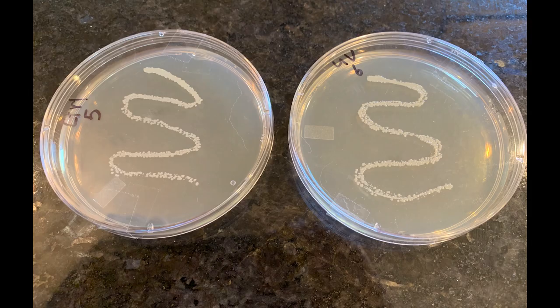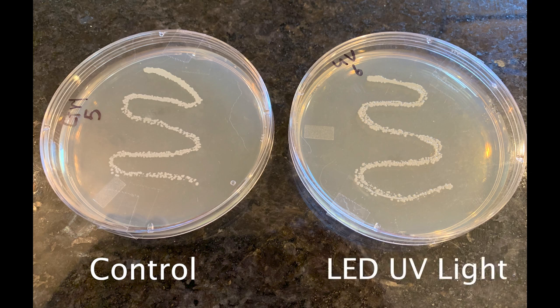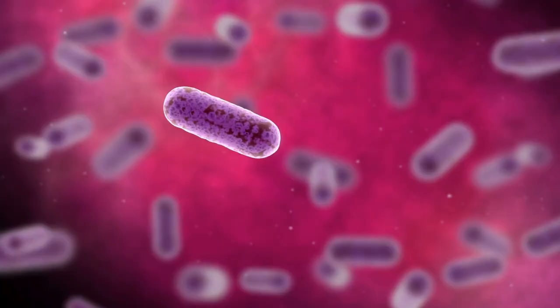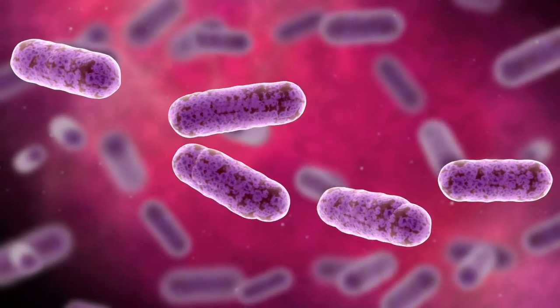This is what happened: absolutely no difference. The plate on the left is the control, and the plate on the right was the bacteria I exposed to the LED light — they both grew bacteria. I actually repeated this experiment a few times, exposing it for different lengths of time, and I got the same results every time. So that means this is a complete waste of money. It cost me $79, and that was $79 down the drain. I will never order this again, and neither should you.